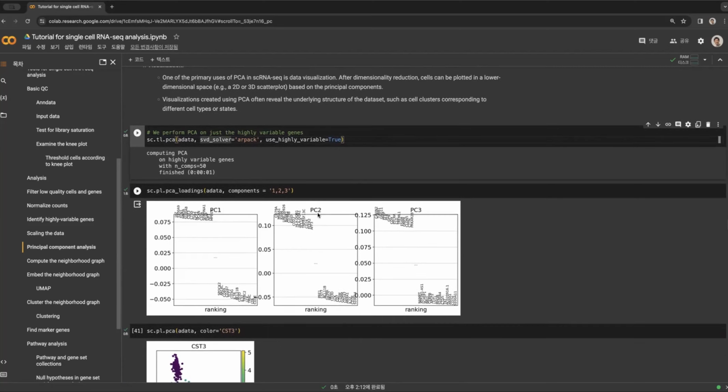So this is PC1, PC2, and PC3, right? And each of the points you can see are highly variable genes. So first thing is, can you see that? You probably see it from the notebook I provided you. This is LYZ, and the next one is S100A9 something, and you have this order. So as you can see here, a number of genes make a distinction between these two axes, right? So the values here don't really have meaning in a biological system. It's more like eigenvalues, right?